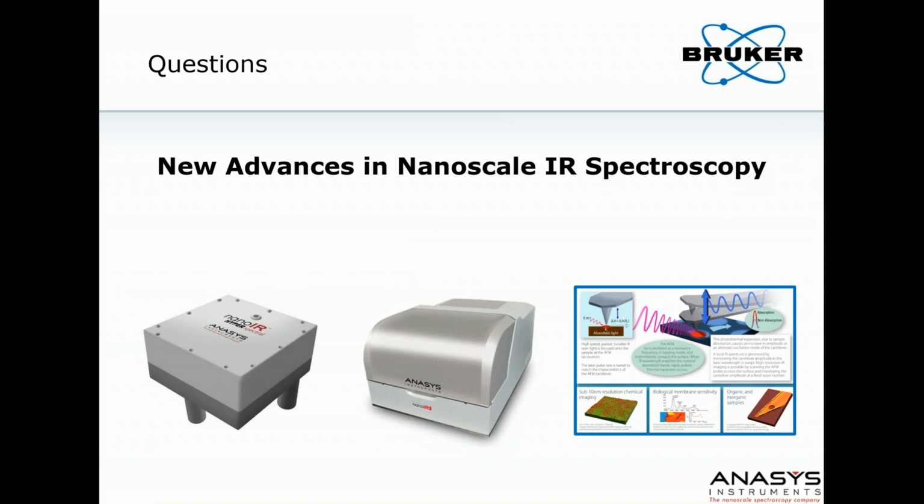We're working with a number of mid-IR laser manufacturers to make sure that the spectral range, the performance, and the price also improve in all vectors. We're trying to cover the range from 650, 670 up to 4,000.